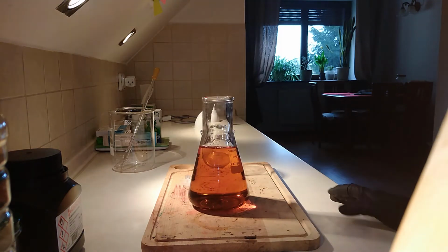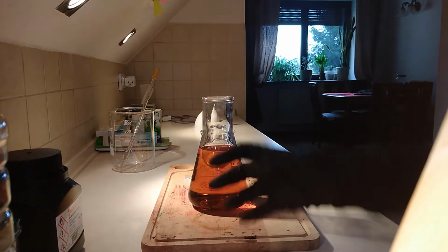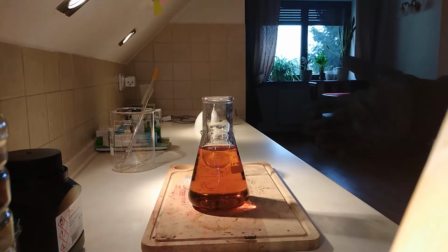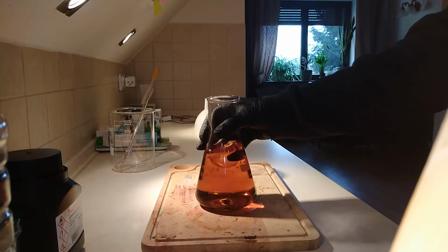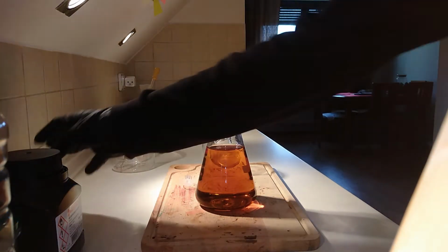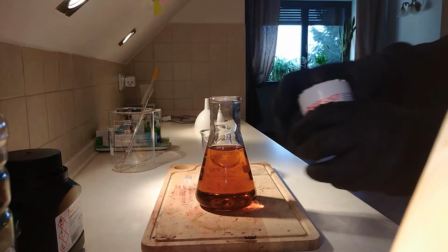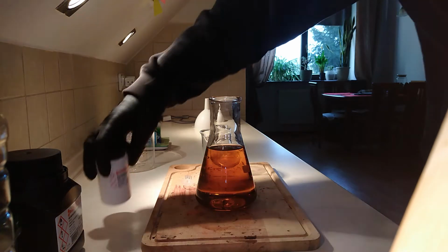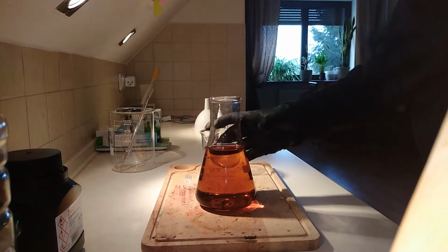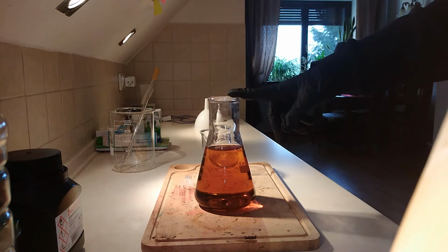Reducers reduce the oxidation state, while oxidizers increase it. So here, because sucrose is a mild reducer, we need sodium hydroxide for them to react, as it needs to be done in an alkaline medium. So this causes them to react, and first it goes to this.